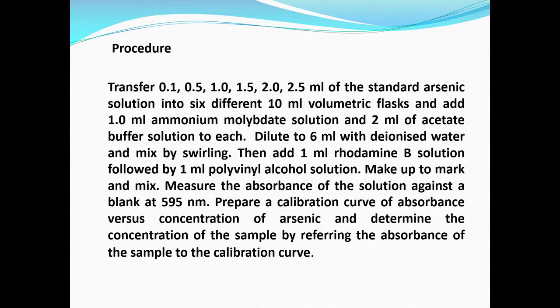I do not have to tell you that you have to dilute it up to 10 ml and measure the absorbance against a blank. Again, a blank is necessary because it is also red in color, and as I have told you, molecular peaks normally overlap each other. So, the color of the blank must be subtracted from the color of the sample.